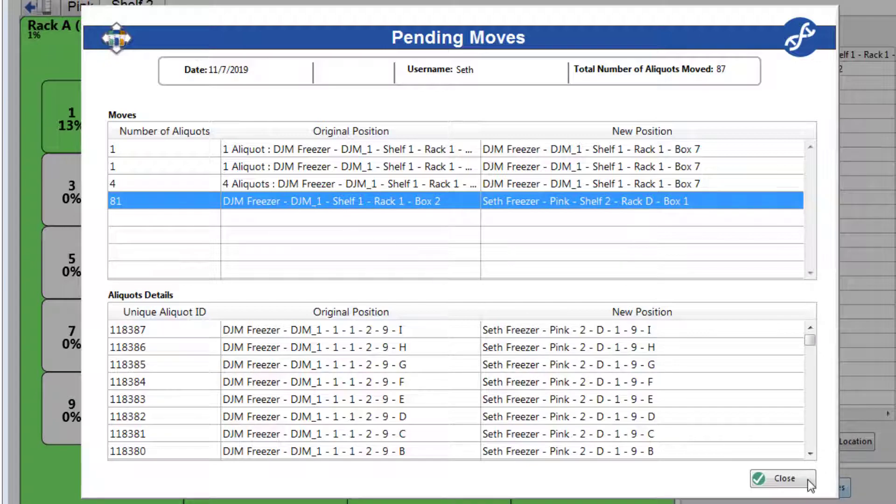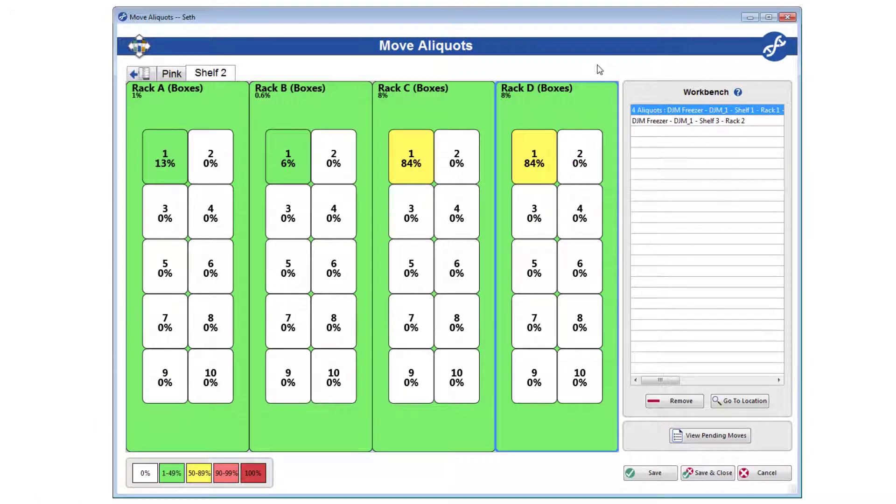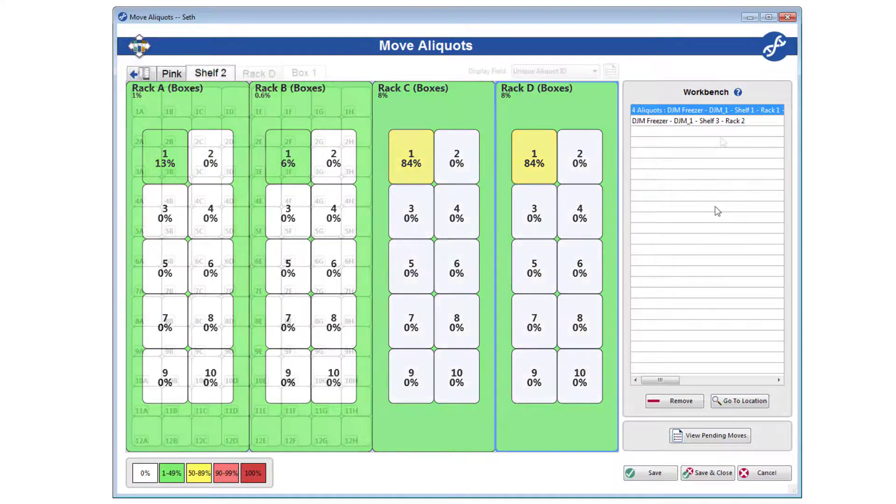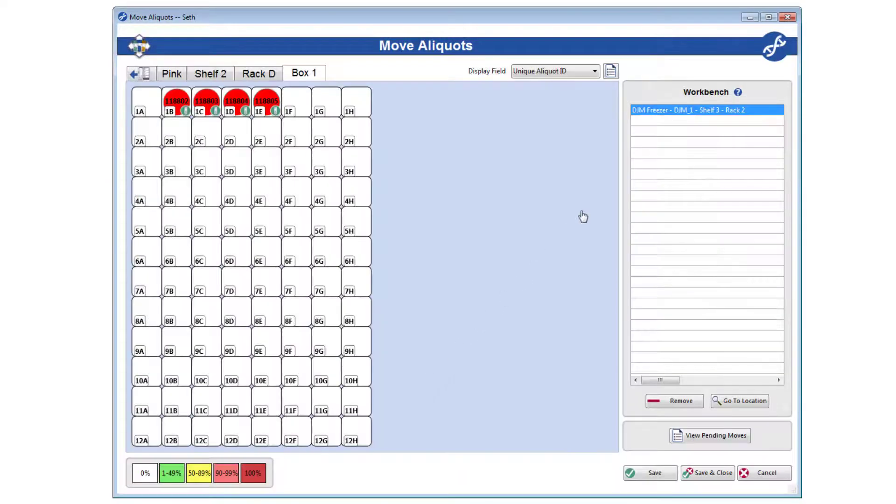Close won't save the moves, but just return you to the move aliquots form, where you can continue moving aliquots, save the pending moves, or cancel it all. Just know that you will not be able to save with anything still in your workbench. All workbench items must be moved or removed.